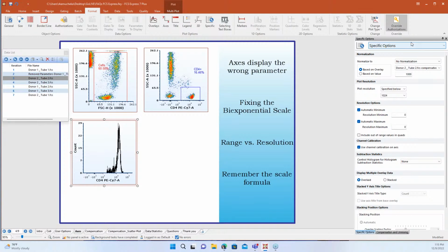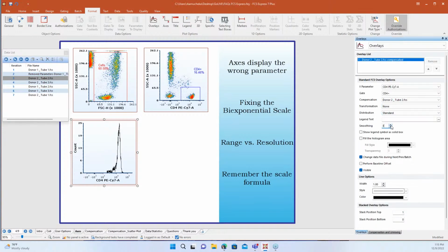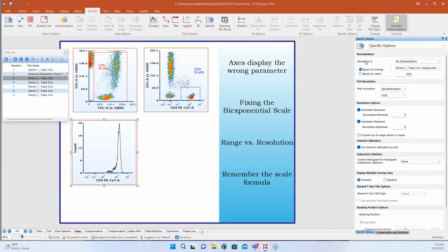Whereas range, if you're changing the range and it's outside of what you have on your plot, then sometimes you can get that really stretched effect too. So people will write in saying they're having trouble with scaling, and now everything looks like it's stretched, like they've literally pulled it. And you'll get that a lot by using the range, but you won't see that if you do automatic minimum and maximum in the specific option. So I always encourage people to try that first before they start messing with the range.